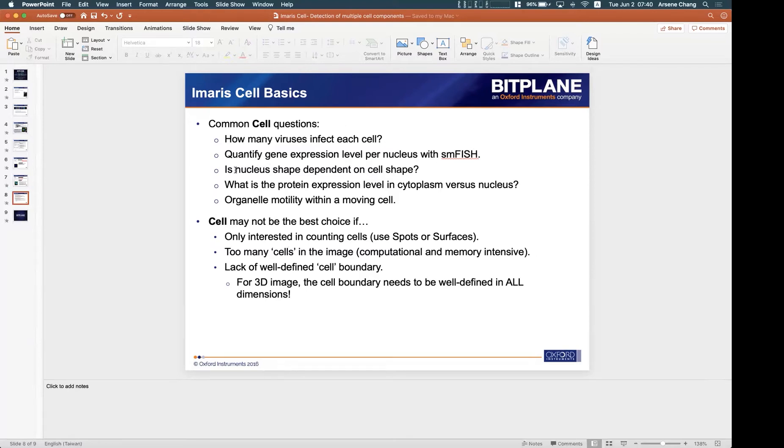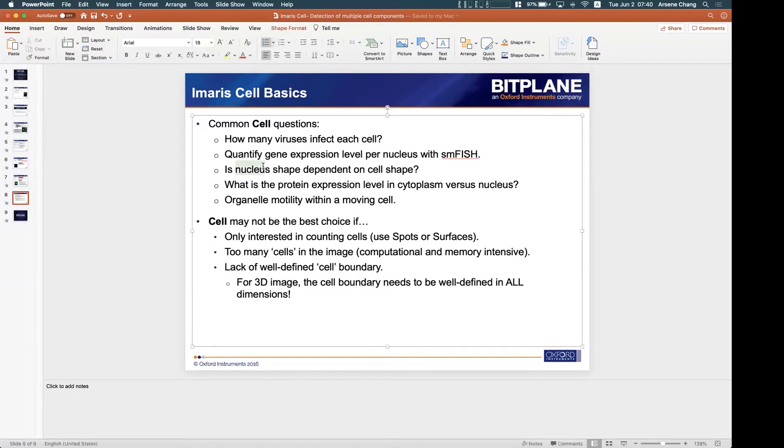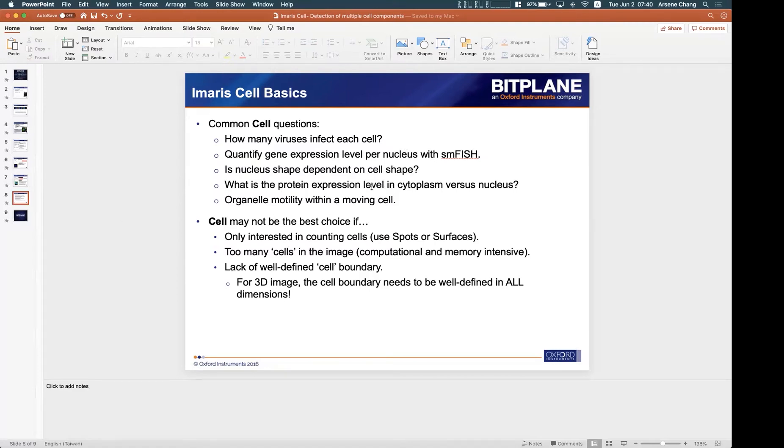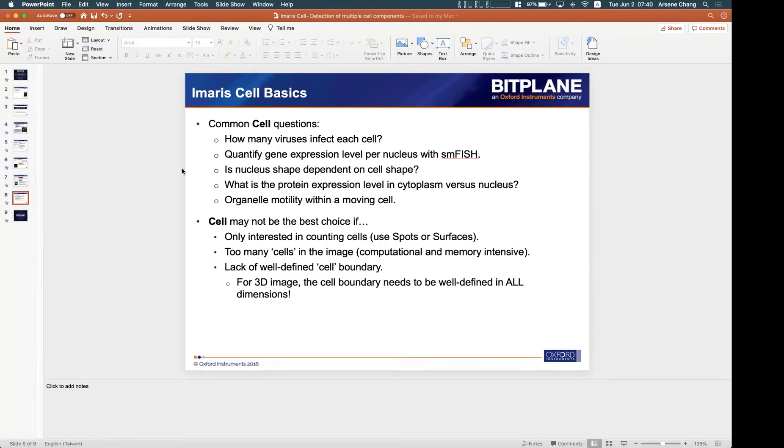So maybe the nuclear shape depends on the cell shape or is irrelevant, so you can have that calculation. Also protein expression level in cytoplasm and nucleus, and organelle motility within the moving cell, etc. So all these questions we can use cell module to answer.